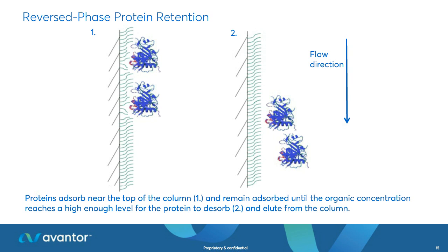Peptides have a more similar mechanism of interaction with the column to a small molecule, but they do tend to be a bit like a large molecule, a bit like a small molecule, depending on their structure and folding as well. So it does make sense to have a longer column for peptides, but for proteins, unless you want a higher loading for purification, for example, then you can get away with quite a short column length, save some time.